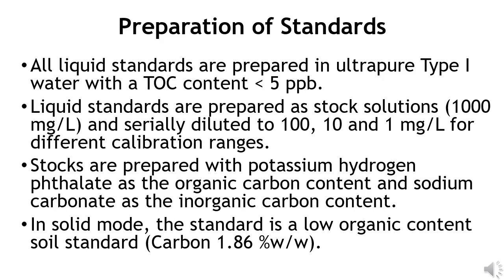Stock solutions are prepared with potassium hydrogen phthalate as the organic carbon content and sodium carbonate as the inorganic carbon content. In solid mode, the standard is a low organic content soil standard with a carbon percentage of 1.86 weight over weight.